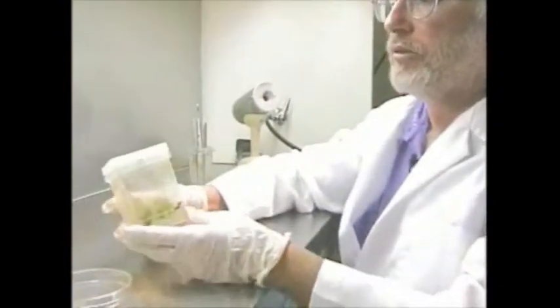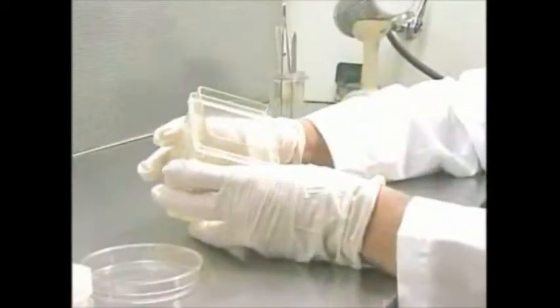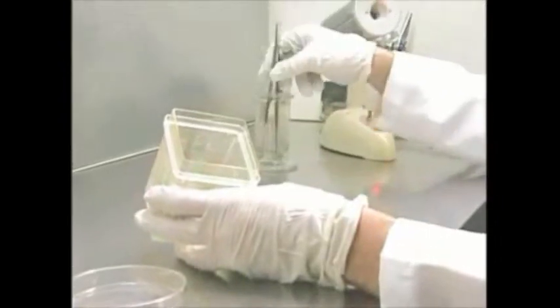I need to grab a petri dish up here. This has been pre-sterilized. And this is a culture box that has been initiated already. What we're doing is going through one of those rounds of multiplication. Use the forceps here.